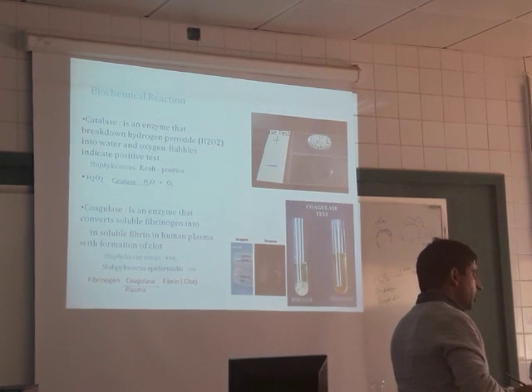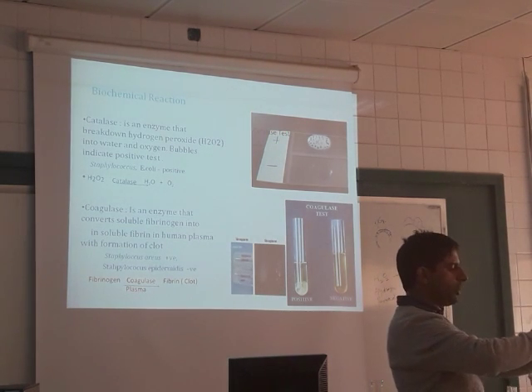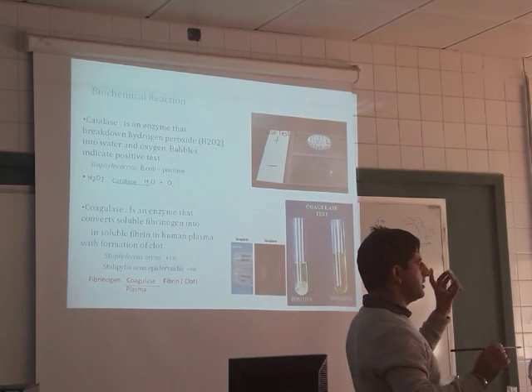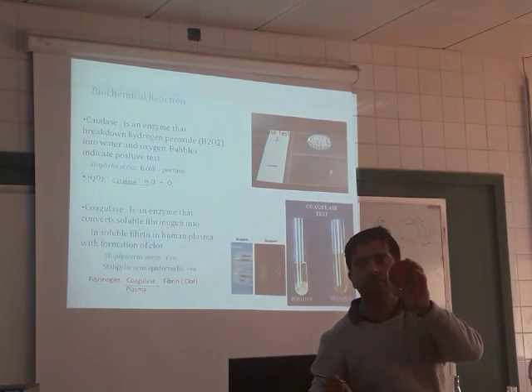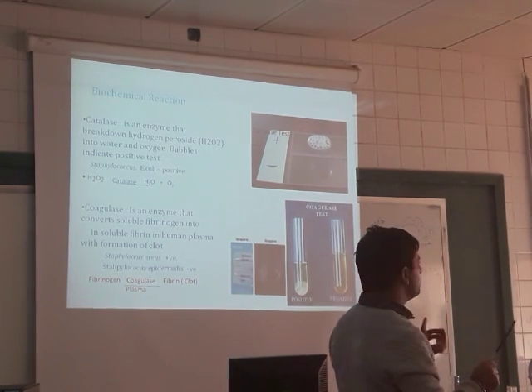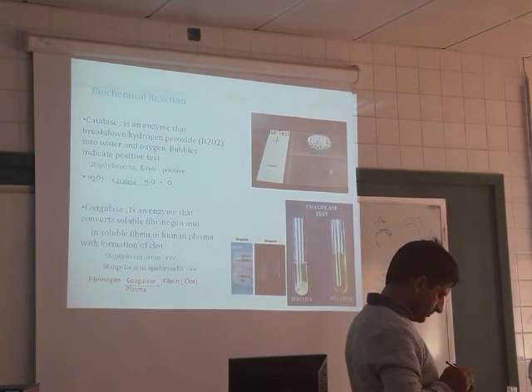Now on this slide, I have put drops of hydrogen peroxide. Here is a culture of a bacteria. Now I will show you that this microorganism contains the enzyme catalase and will break down hydrogen peroxide into water and oxygen.